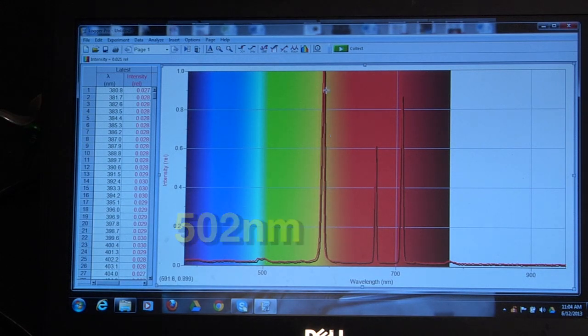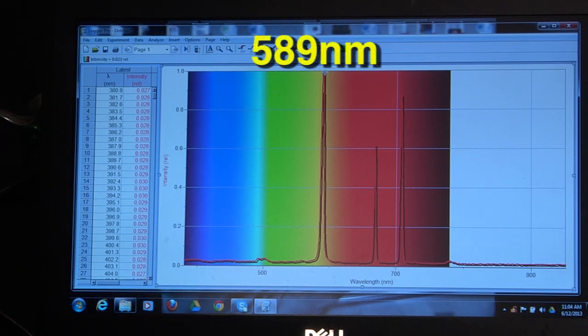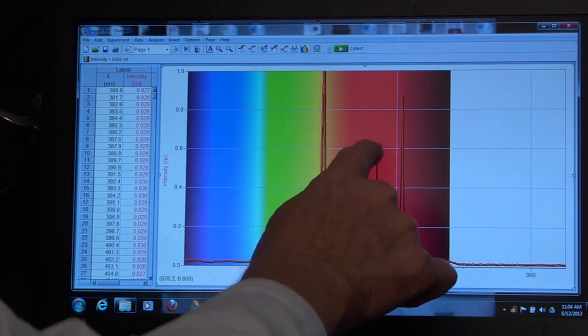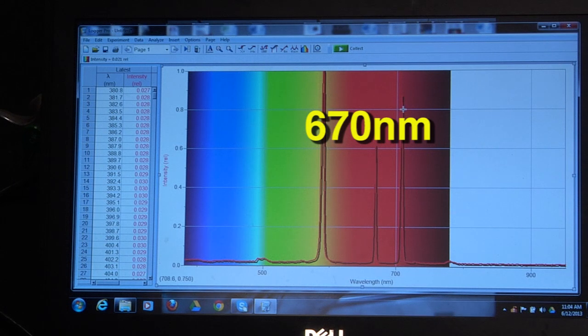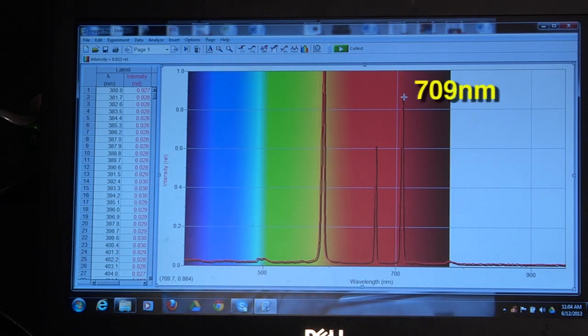But the three very significant ones are here at about 589, and here right here at 670, and here at 709.